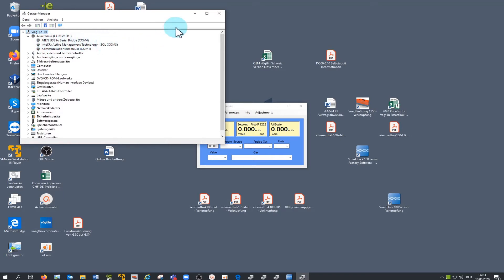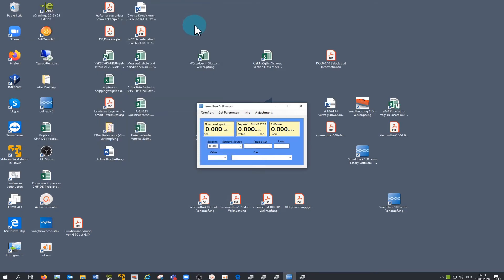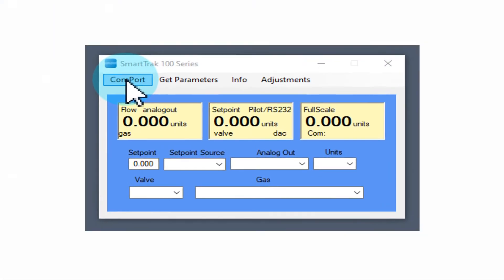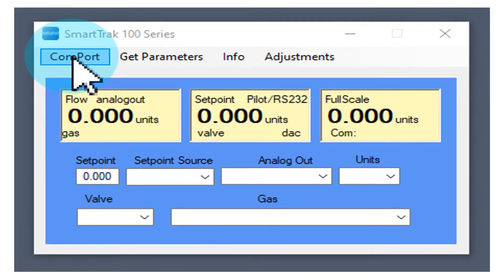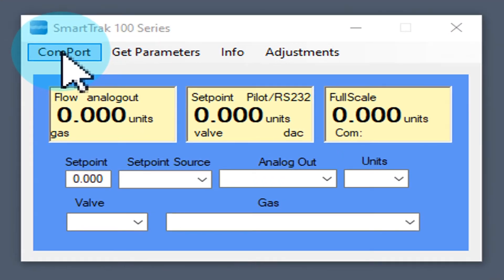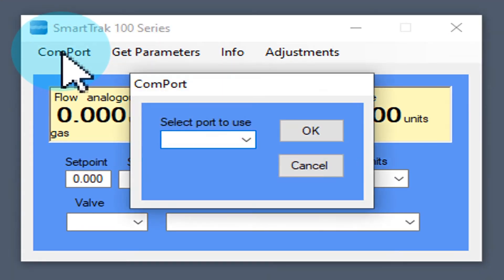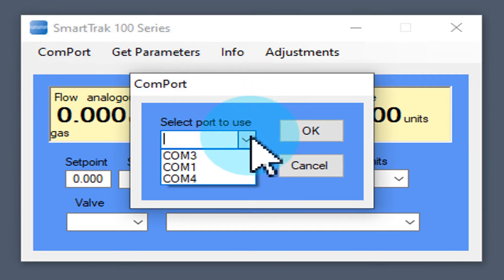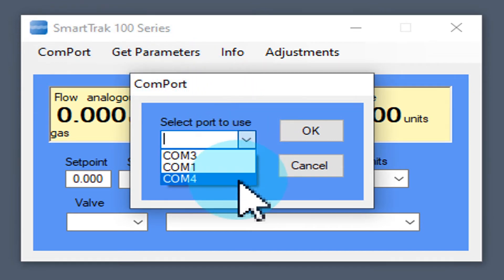Close the window of your device manager and go back to the SmartTrak 100 series app. Open COM port, select the port previously shown in the device manager, confirm by clicking OK.